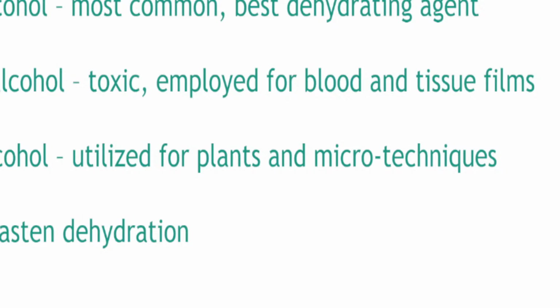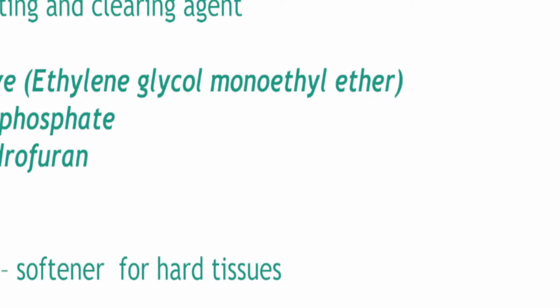And it's usually utilized as an urgent biopsy dehydrating agent. Okay, we can also use diethylene dioxide, which is another universal solvent because it can be used as a dehydrating agent as well as a clearing agent, making sure that we can immediately impregnate the sample, or penetrate the sample with paraffin.